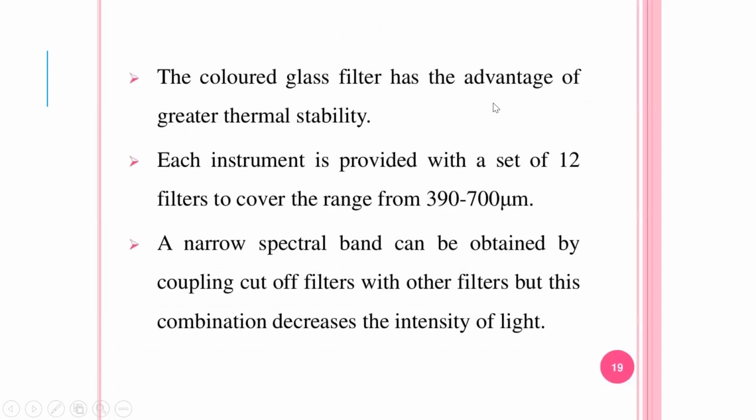Next, this colored glass filter can be used in this wavelength range, 390 to 700.